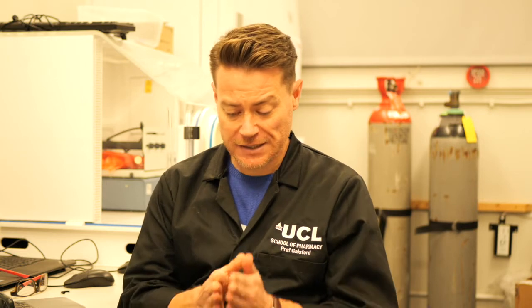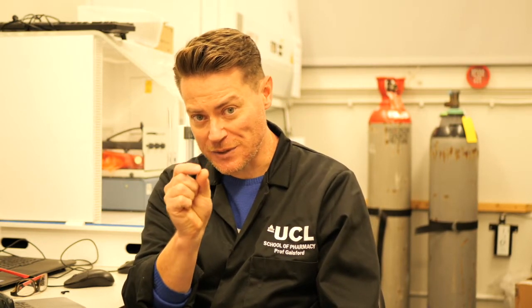So for each individual microscope, there's a term called the resolving power, which means the limit between two side-by-side objects that can be resolved. What we want is the resolving limit, or R as it's called, to be as low as possible. So the smaller the R value, the smaller the distance between two adjacent things that you can differentiate. So R wants to be as small as possible.